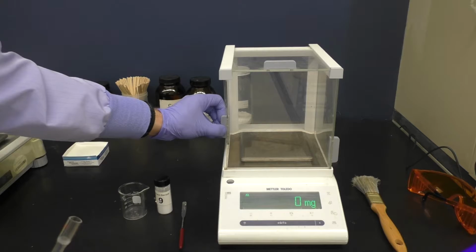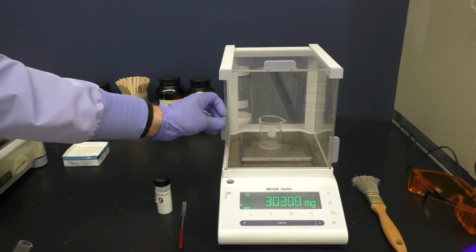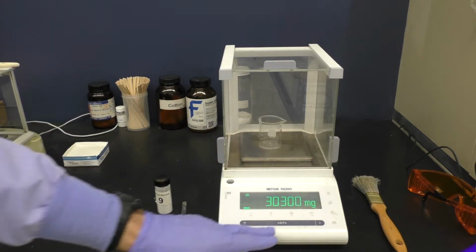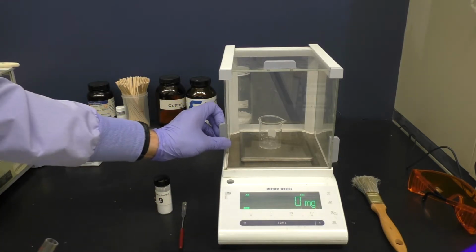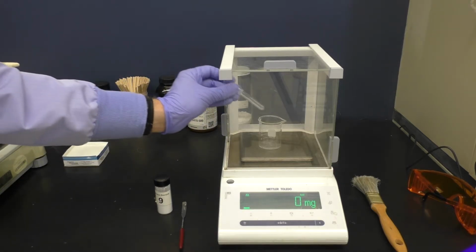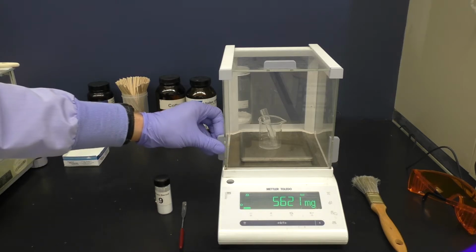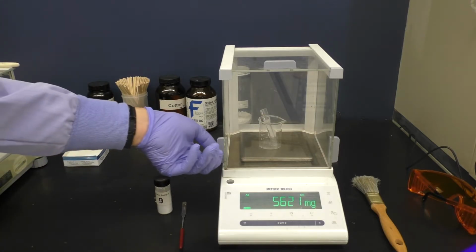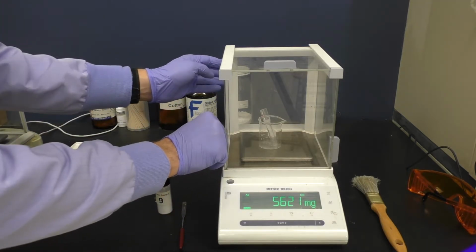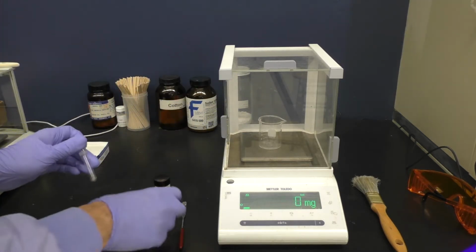Instead, I will take a small beaker, tare the beaker, and then simply add my Craig tube onto the beaker to get the empty mass for the Craig tube. So now that I've got the empty mass for the Craig tube, I'm going to take the material that I want to recrystallize. Take unknown 9.